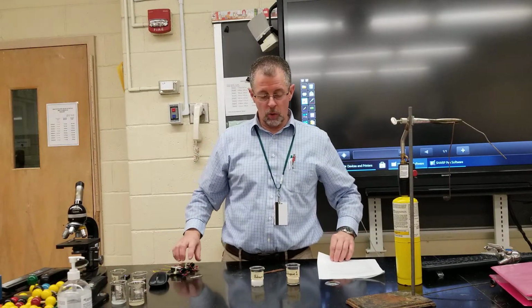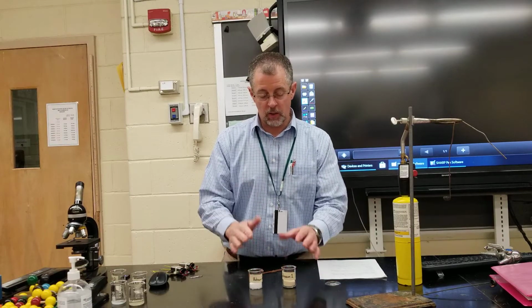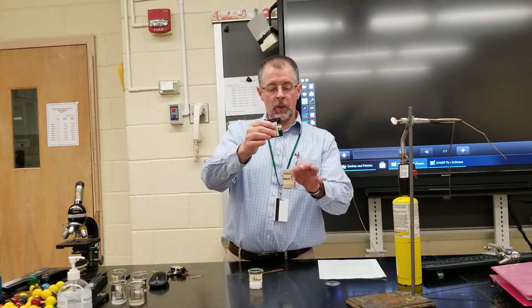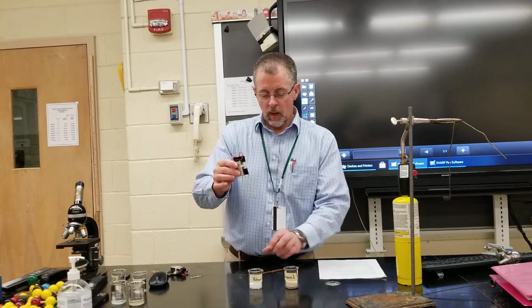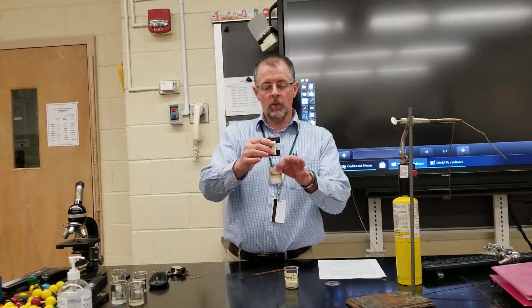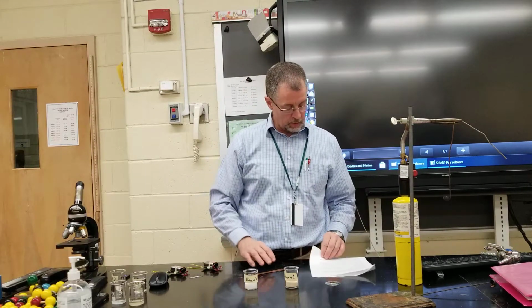Now, what we're going to do is see if these two substances will conduct in the solid phase. If I simply put the electrode into the solid phase of unknown number 1, we see that it does not conduct in the solid phase, does not light up. For unknown number 2, we do the same thing. We stick it into the solid phase and we see that it does not light up. So neither one of these conducts electricity in the solid phase.